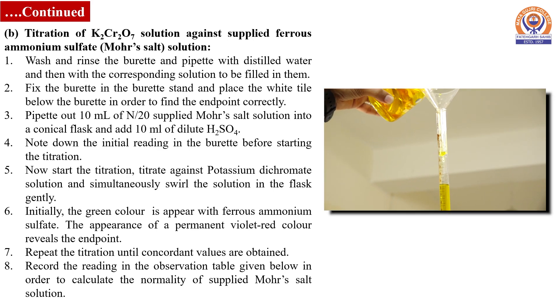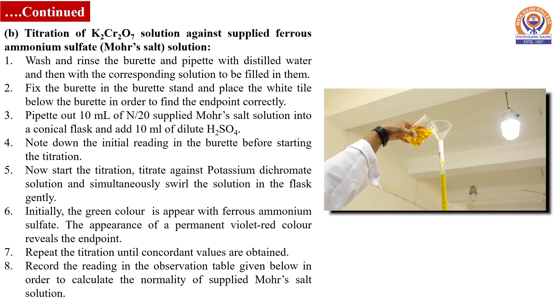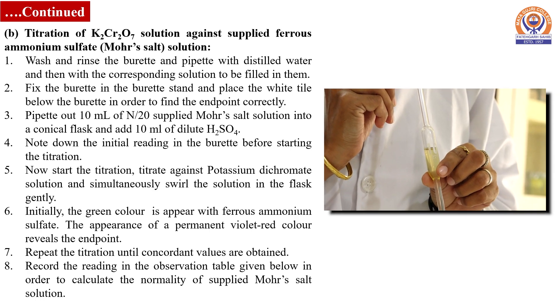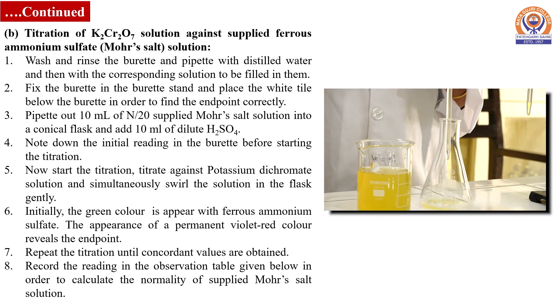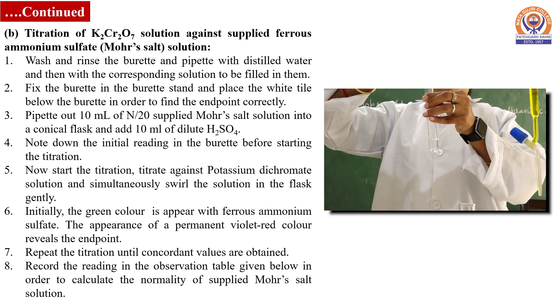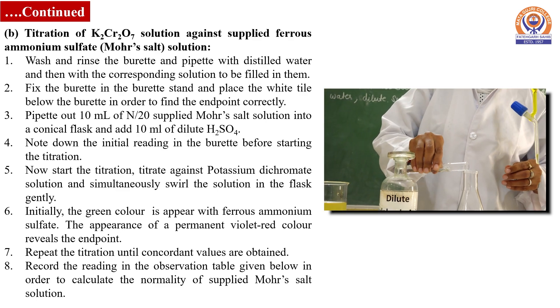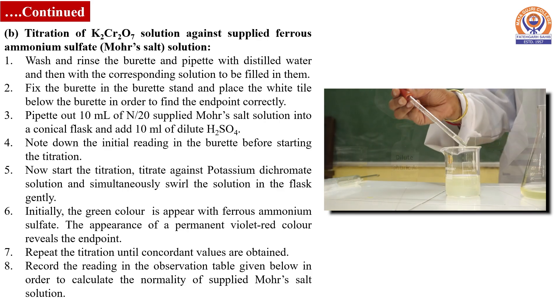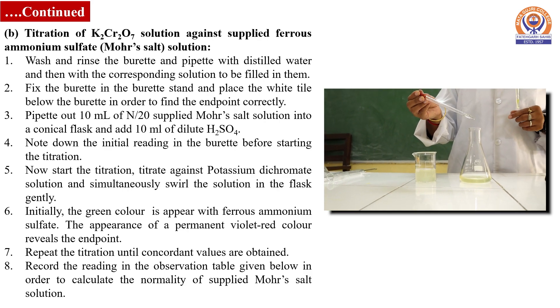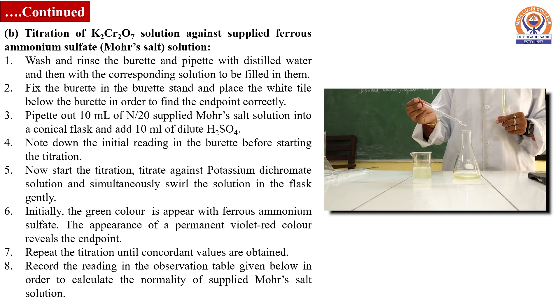Rinse and fill the burette with N/20 potassium dichromate solution. Pipette out 10 ml of Mohr salt solution and transfer to a titration flask. Also add 10 ml of dilute sulfuric acid to the conical flask.